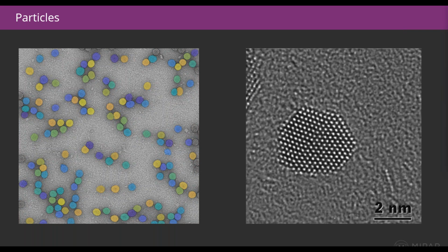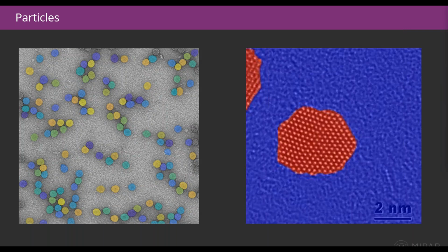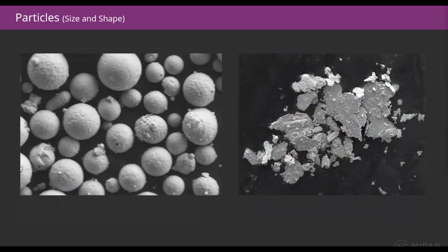Even down at the atomic resolution, where you're needing to employ a texture-based segmentation, there's no real mean intensity differences between these two regions. Throw the grid at it, and it will come back with a segmentation for you. Now, in some other cases, like these particle examples here, we can target Spotlight more specifically to improve performance and efficiency further. Before you saw simple grid prompting for a look everywhere kind of approach.